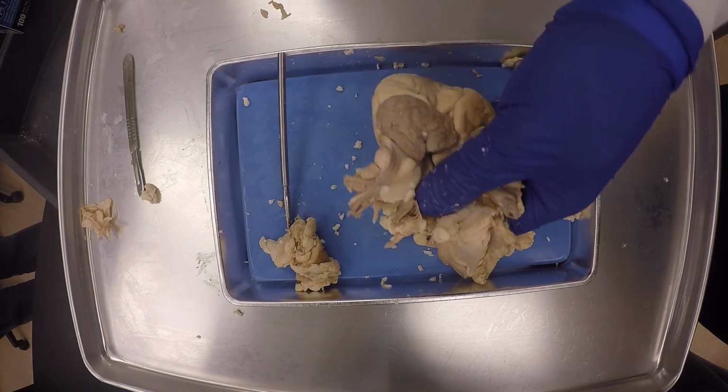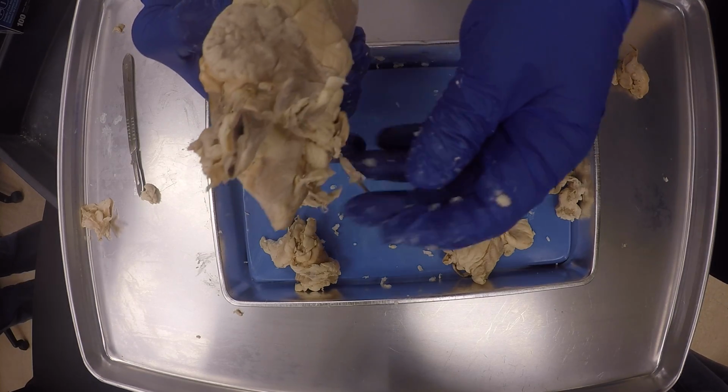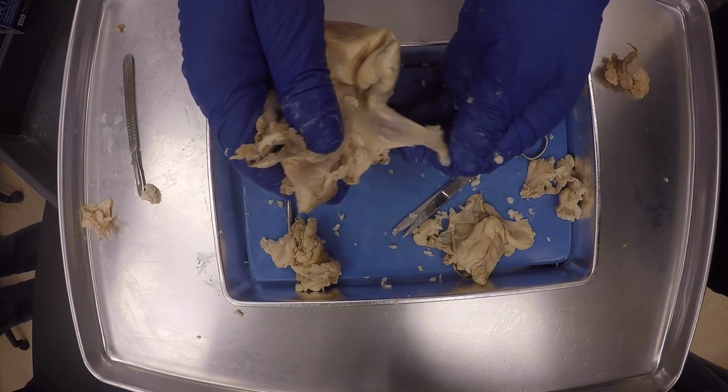So can you not see the anterior vena cava? Yeah, it kind of gets cut off a little bit. I just didn't see it on the heart.